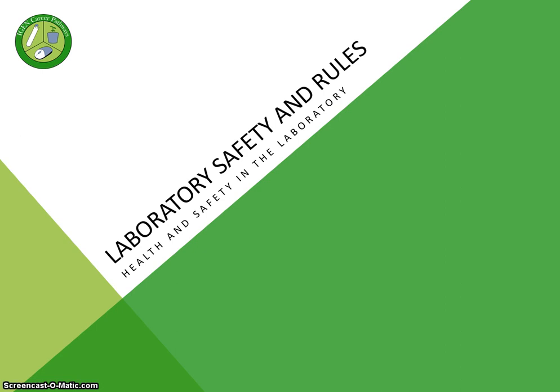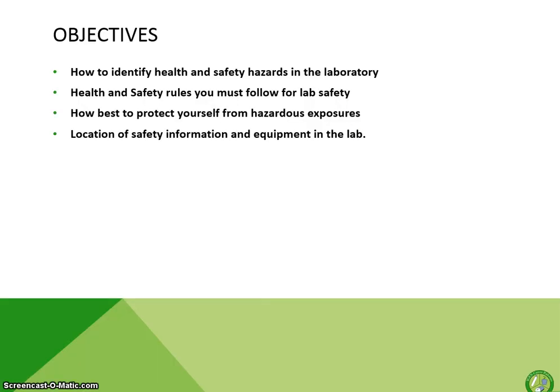BFM202 biodiesel production. Today we're going to talk about lab safety in preparation for our first lab. I want you to know that your safety is number one. The objectives are to learn how to identify safety hazards, know the lab safety rules, know how to protect yourself, and know how to locate safety information in the lab.